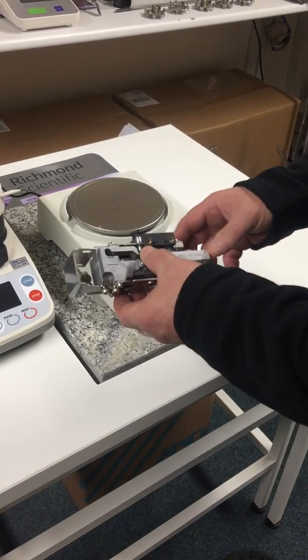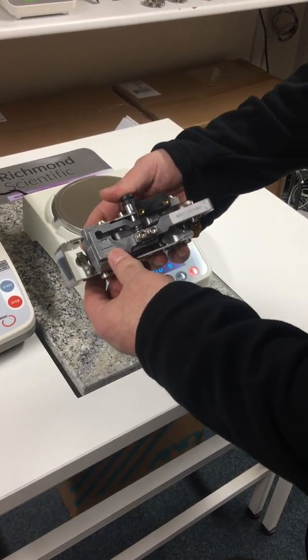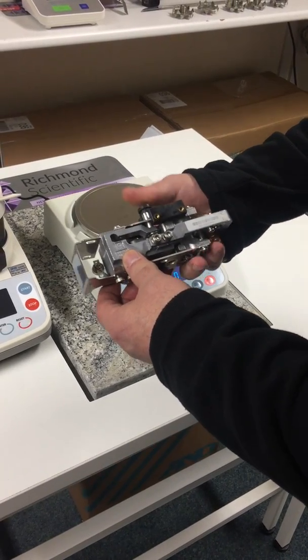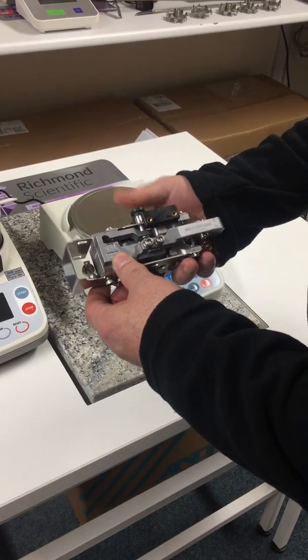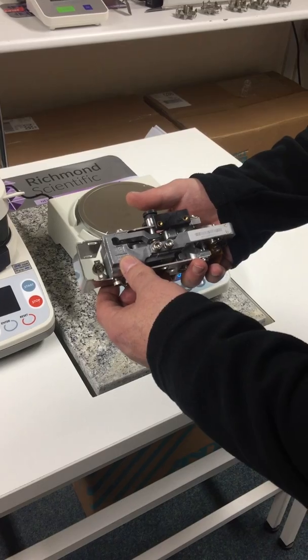The heart of this balance is the thing called the Super Hybrid Sensor, and this makes the device extremely robust. This has been designed for use in areas, for example with undergraduate students, in a production facility where things can be roughly handled.